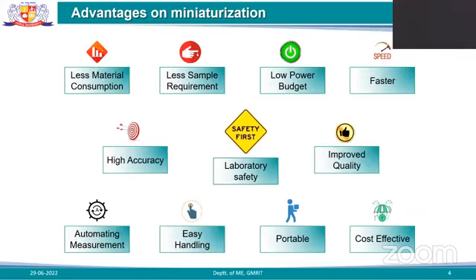Whenever we are doing the same test through the conventional way, if the requirement of blood is 20 ml, then similarly the sample requirement with which it will be mixed, and then we get the result, the requirement of the chemical will also be less or also high. It may be 20 ml if it is equal. If it requires double, then it will be 40 ml.